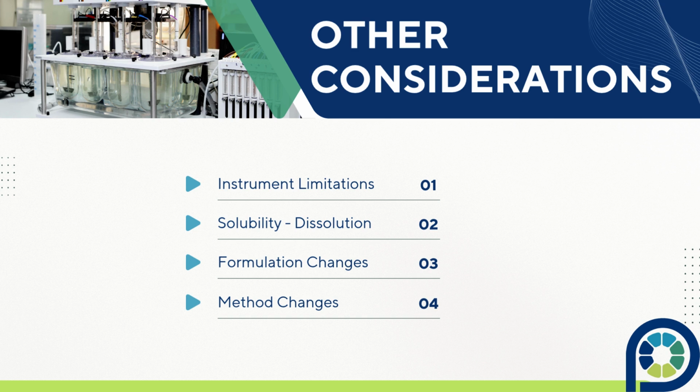There are some exceptions to how an accuracy experiment is performed, and any variations from typical or established procedures should be justified. But in the case of dissolution, some guidance is offered. For instance, if you are performing dissolution on a poorly soluble compound and the specification is not within the typical release limits, the ICH allows you to dissolve the API in a solvent that it is soluble in and spike that solution into the media. The caveat is that the amount of solvent added must not exceed 10% of the media volume.